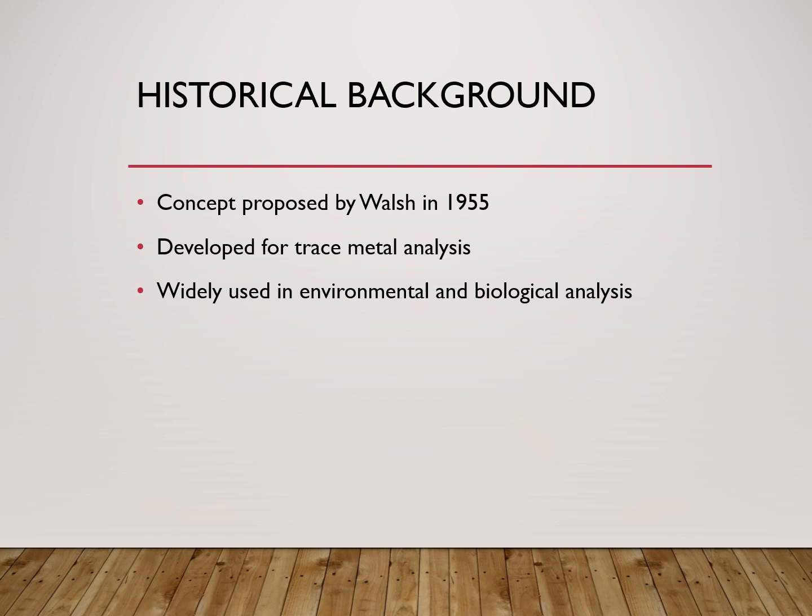It is a very useful technique for metal analysis, and it is very widely used for metal analysis in environmental, biological, and industrial samples.